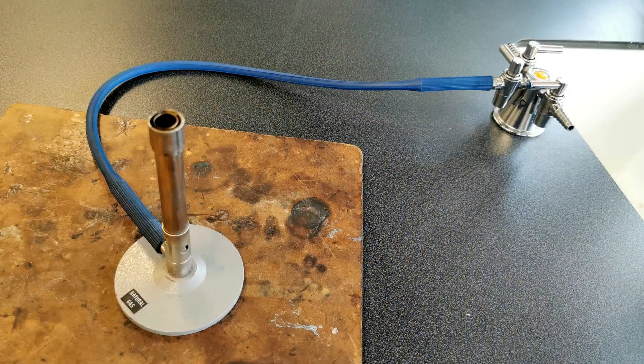Now speaking of the heat mat — if your heat mat has a crisscross woven pattern and feels fairly soft, that's actually the underside; you've got it upside down. Your heat mat should be hard and smooth on top — probably dirty — like this one. It's the hard, more shiny surface that's the top, the part the Bunsen actually sits on.